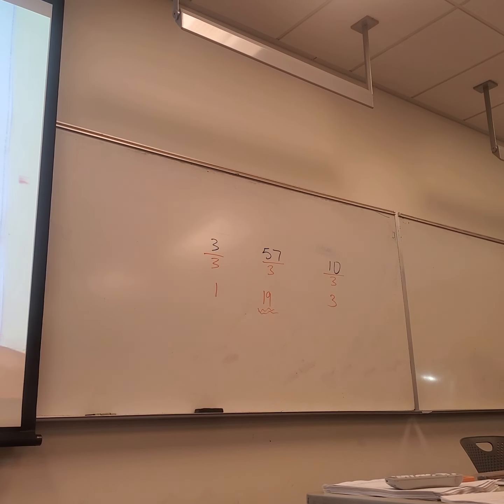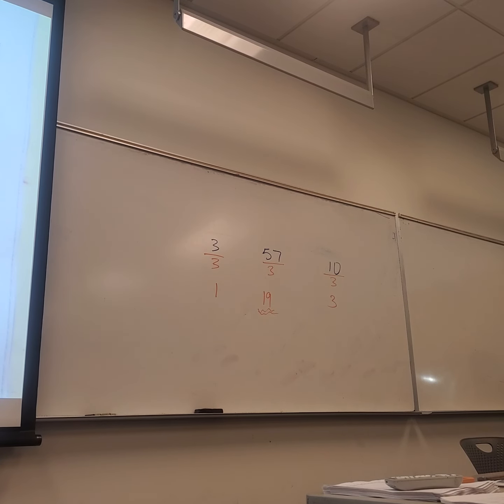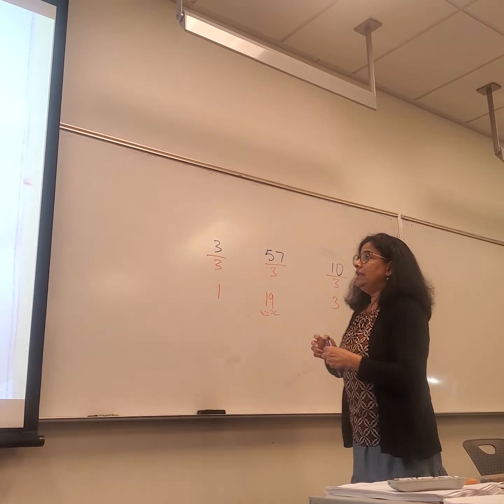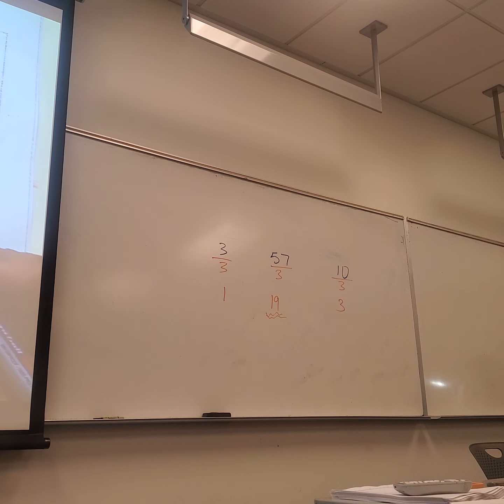Now, this one is very broad, so there is obviously no multiplicity seen because it's broad. By the way, if it's broad, what is our suspicion? OH. Or? Now, there's no OH possible because there's no oxygen in there. So what's the other option? Nitrogen. NH, right? So, NH. This could be the hydrogen on the nitrogen, absolutely.